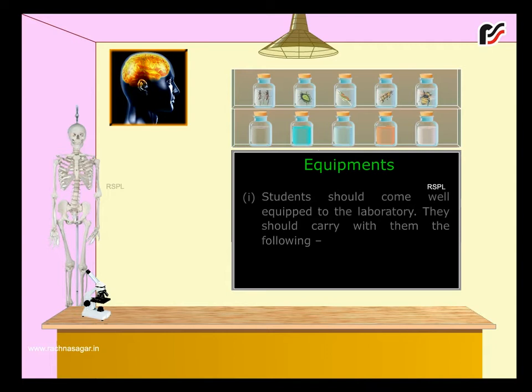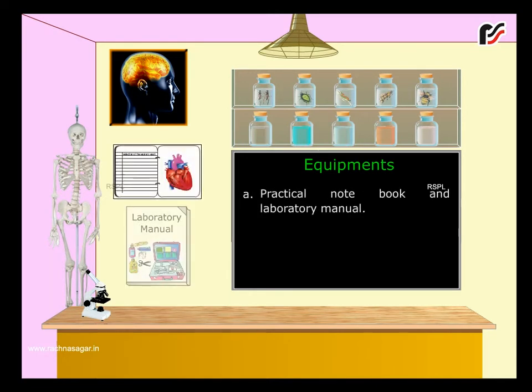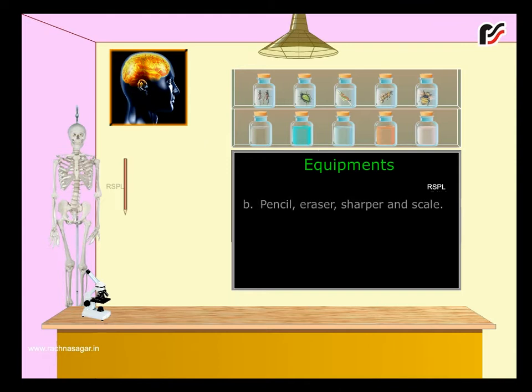Equipments. Students should come well equipped to the laboratory. They should carry with them the following: practical notebook and laboratory manual, pencil, eraser, sharpener, and scale.